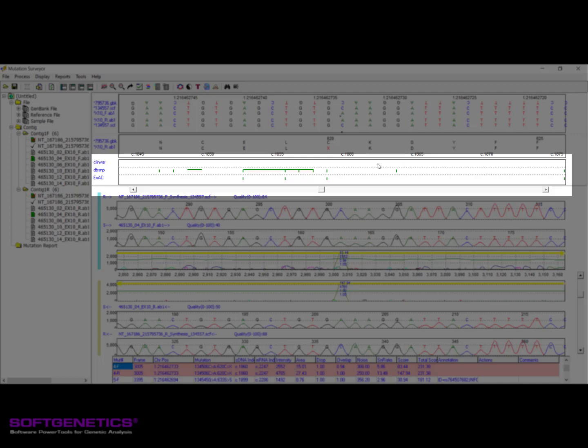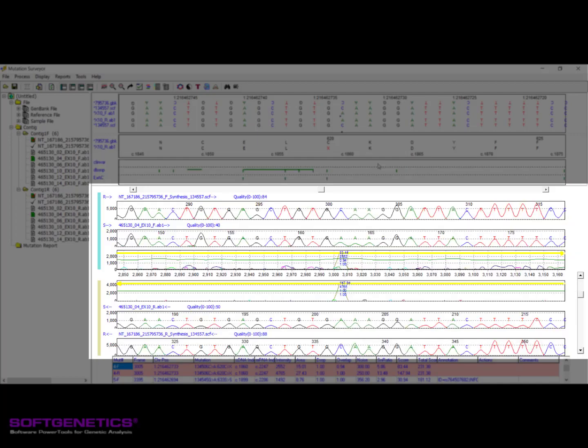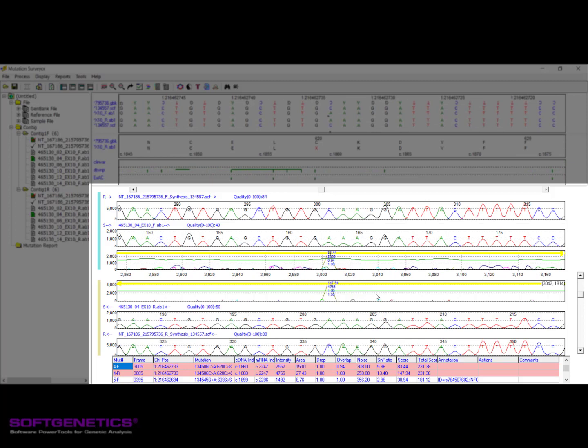The Electropherogram pane provides visualization of the patented anti-correlation technique used for variant detection, with the results of this displayed in the mutation electropherogram we see here in the middle. When working with bidirectional data, both the forward and reverse trace files are displayed together in order to better depict the bidirectional analysis. This pane can be used to manually inspect your trace files and, in conjunction with the mutation table pane below, can be used to add and edit the mutation calls.